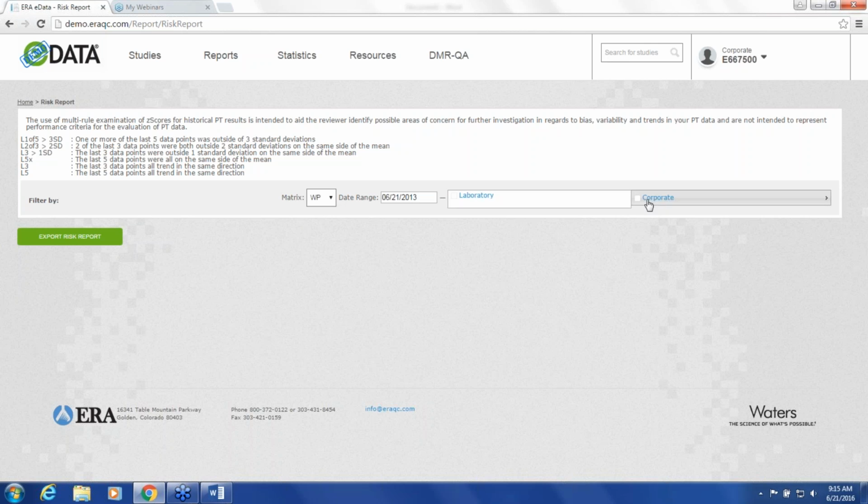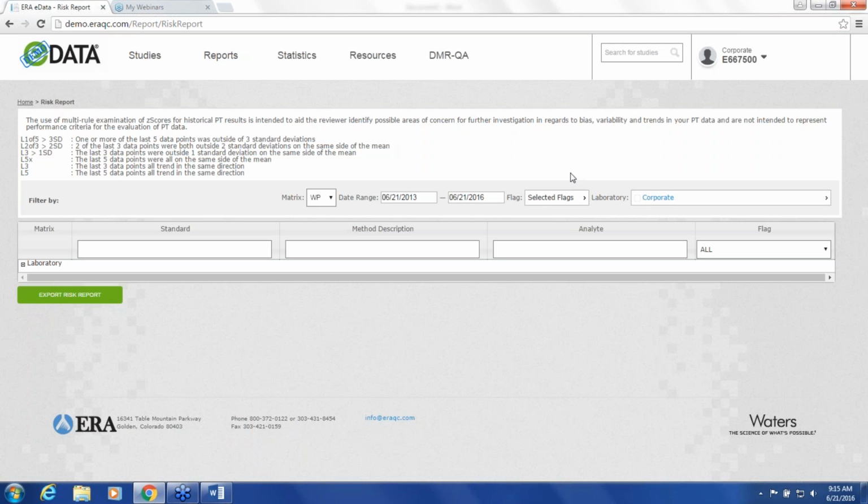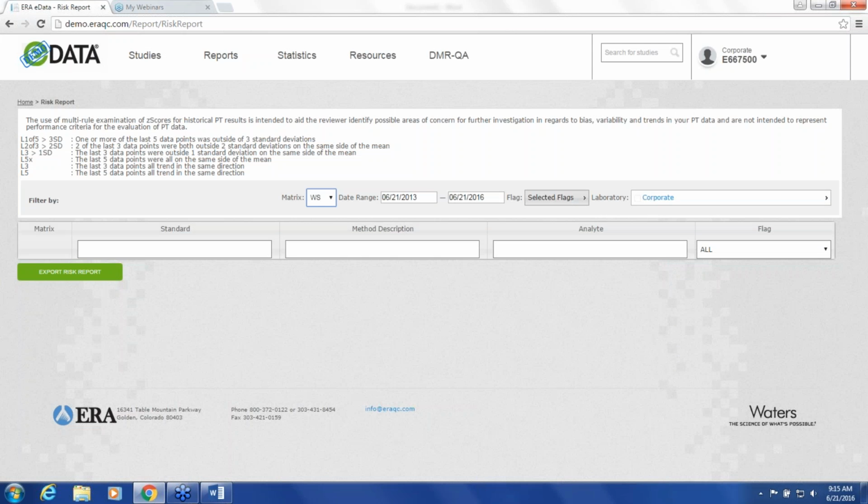So in this case, we'll select our laboratory. Okay, let me select a different matrix here.